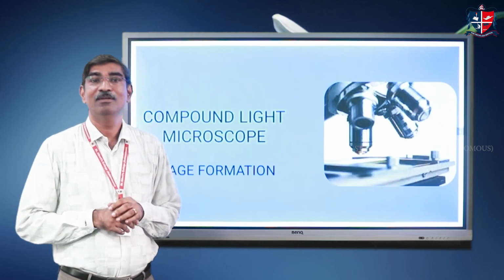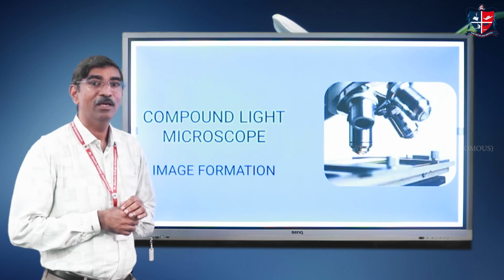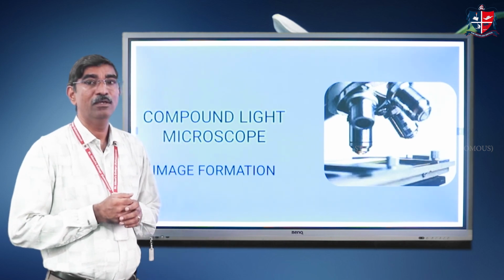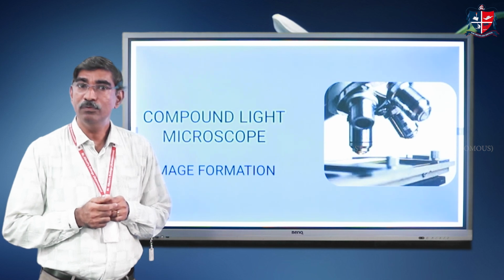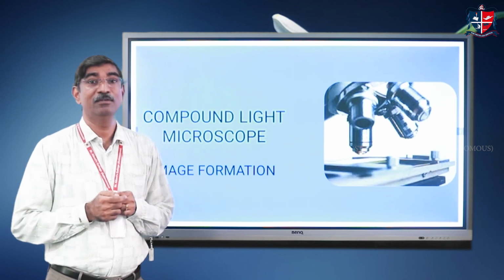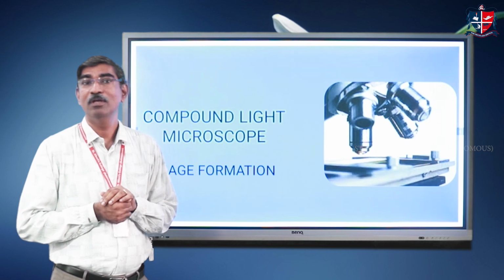Hi everyone. Magnification is an important requirement in the field of any science subjects, especially in biological sciences. Magnification can be achieved by the use of microscopes. And we cannot think of a biology lab without a microscope.